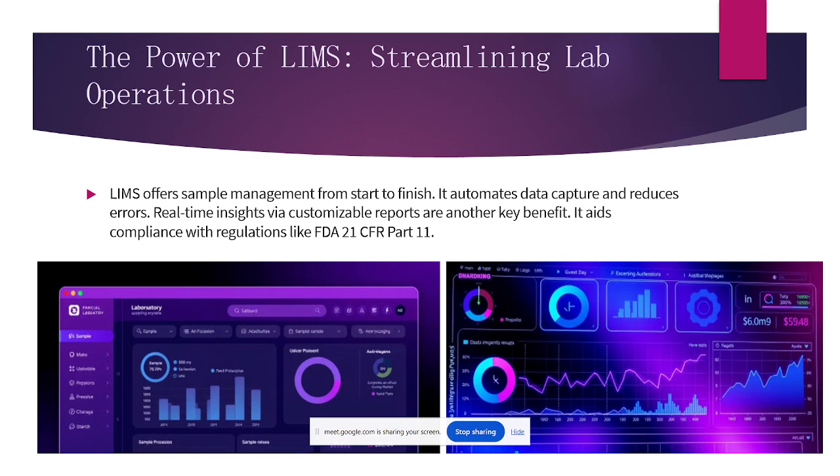So what is the power of LIMS? Majorly it is streamlining of lab operations. Wherever lab operations are there, whatever testing we do in the lab, the data is managed. That's why we call it streamlining lab operations. LIMS offers sample management from start to finish, like a sample life cycle. Once the lab sample is generated, from generation to final reporting and generating the COA, that is the sample life cycle, and it can manage it completely. Then it automates data capture. It will capture the data.